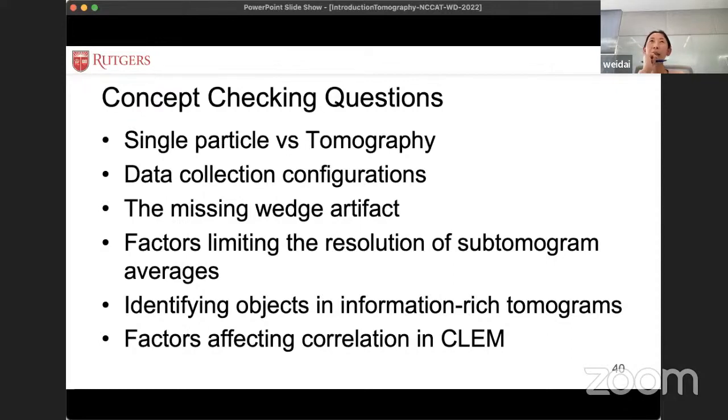And in relationship to ice thickness, this is actually a very good question. Buffer can play a role in ice thickness. But again, as I showed earlier, very often this is a decision between several trade-offs. You want to make sure your sample is stable. That's probably number 1. And number 2, you don't want the buffer to be too thick or sticky, giving you ice that is too thick, so that you can't image properly anymore.